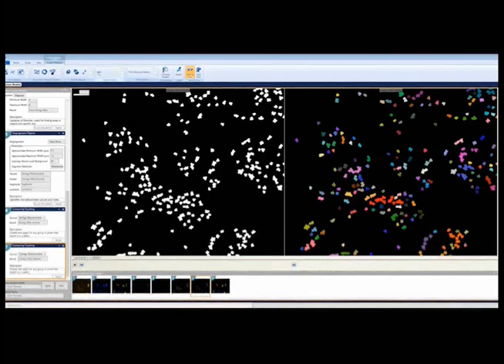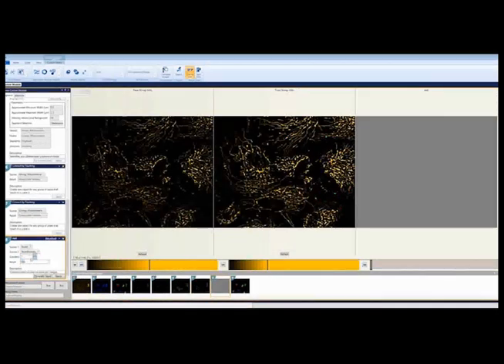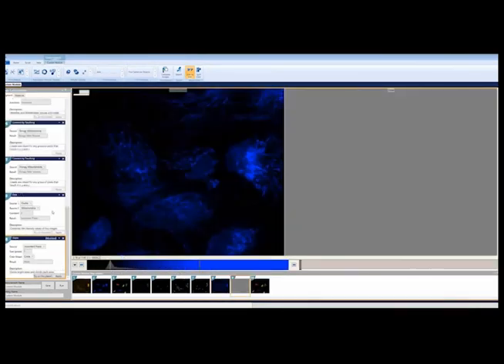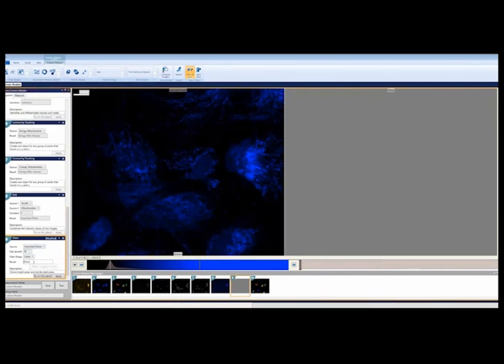To start generating the cell map, we will first combine the nuclei and the mitochondria into a single image to make it easier to find all the pixels we care about. We will then blur the image with a dilate to smudge out the details so that we can connect masks. And then we will segment the smudged cell pixels into a binary mask.